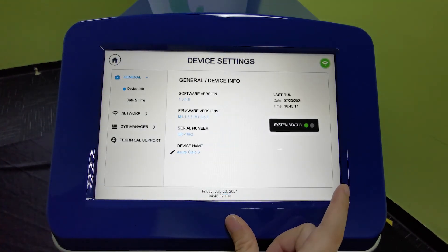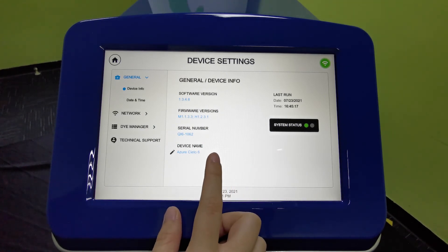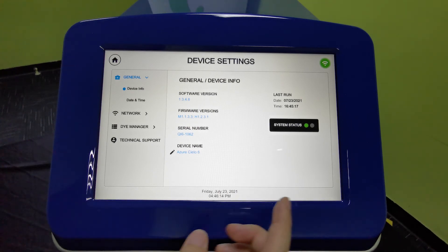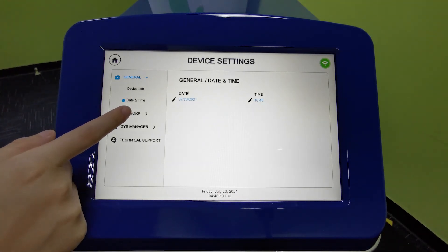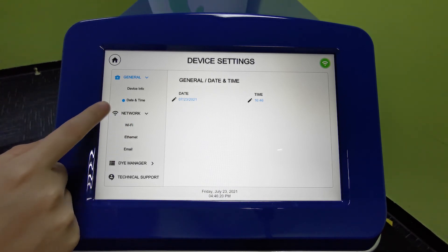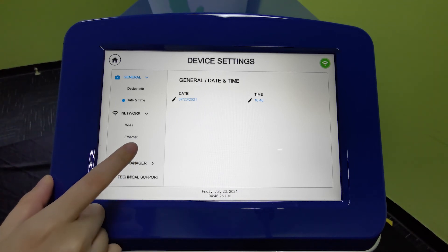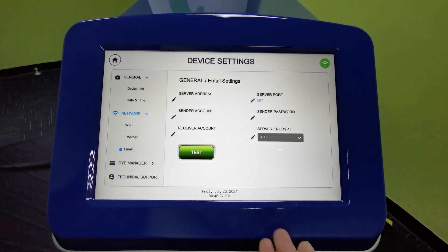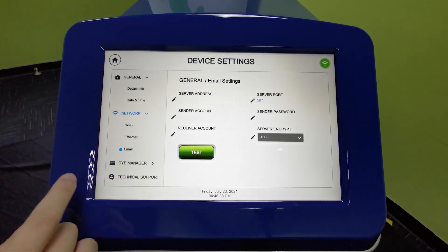Under Device Settings, you can see your device software version, firmware, serial number, and system status — green means all is fine. You can also set the date and time for your time zone. Under Network, you can connect to Wi-Fi or Ethernet for data transfer. The email feature, which I mentioned earlier, will send your completed run and data once the run is done — you can test this after setting it up with your IT department.